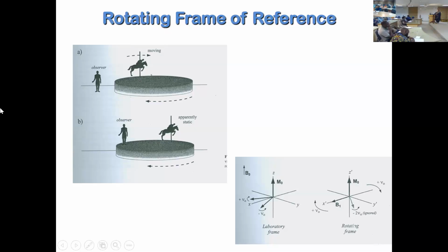When you multiply this chemical shift value with the frequency of your spectrometer, you get hertz. For example, some of you have solved proton NMR and calculated the coupling constant, right? These coupling constants are usually a few hertz, like 1 hertz, 2 hertz, 10 hertz. These protons are not moving in hertz; they are moving in megahertz, but we are observing the difference in hertz. Why are we observing that?